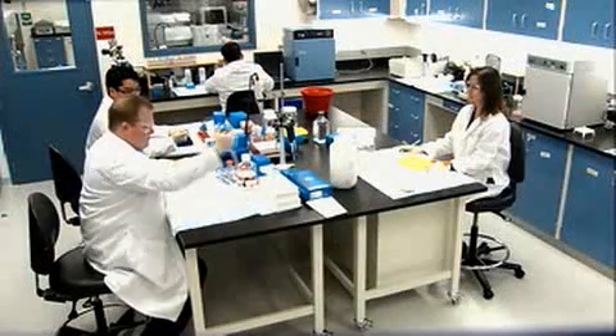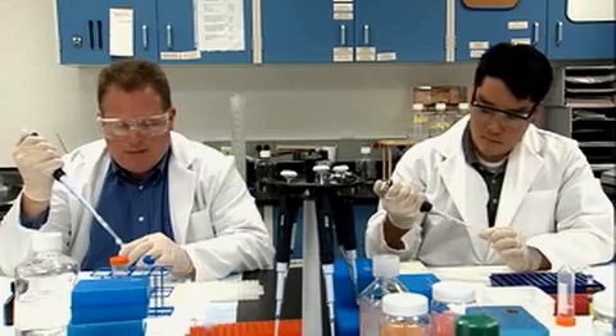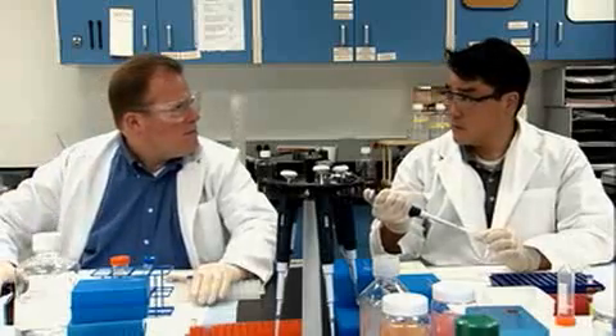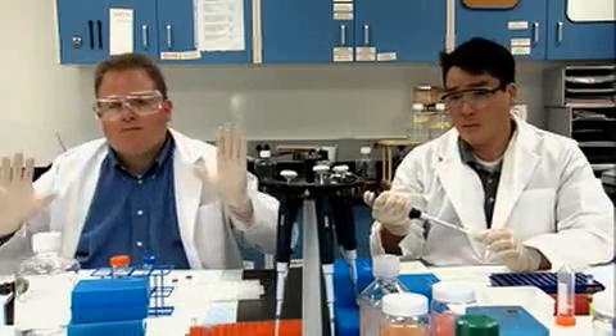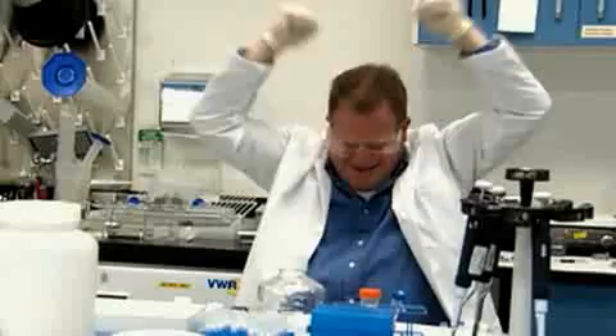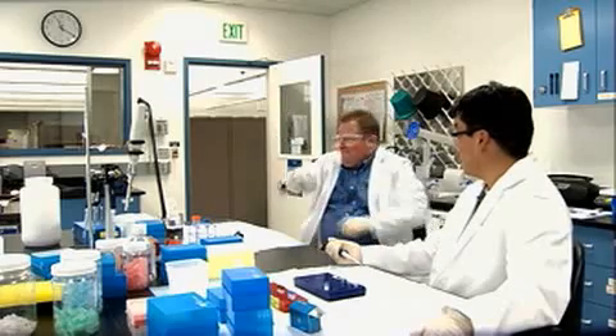He's back in the game, but it looks like he's completely skipped the DNA step. You're absolutely right, Bob. He's skipped the DNA step. And if I didn't know better, I'd say he's already eluting. Could it be? I think he's done it. 20 minutes — I think we're looking at record time here.